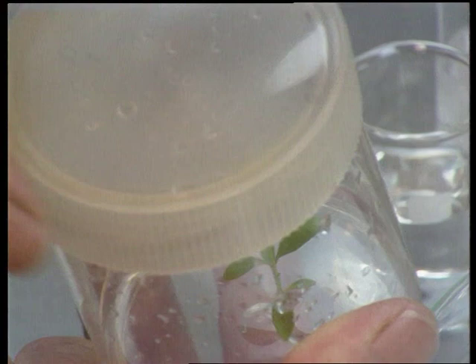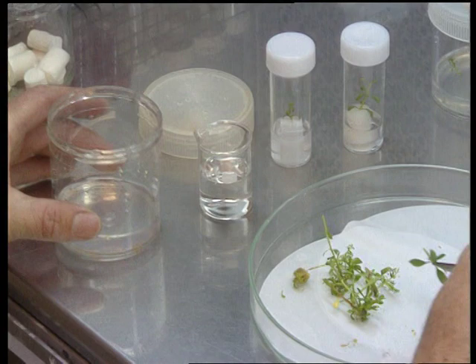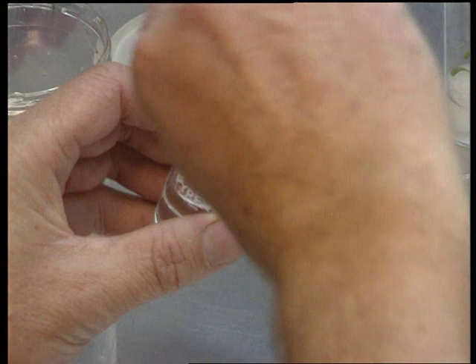With other plants, rooting is best if the propagule is kept in the auxin medium for only 1 or 2 days and then transferred to an auxin-free medium. Or the propagule may simply be dipped into a rooting solution immediately and inserted directly into an auxin-free medium.